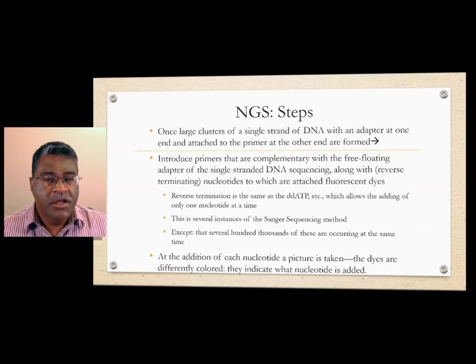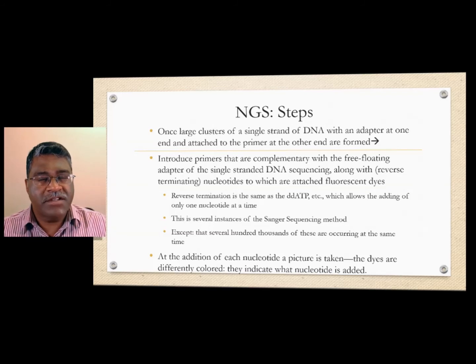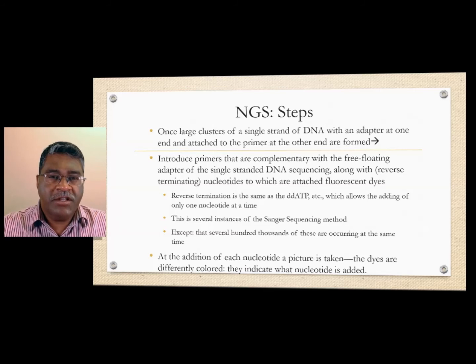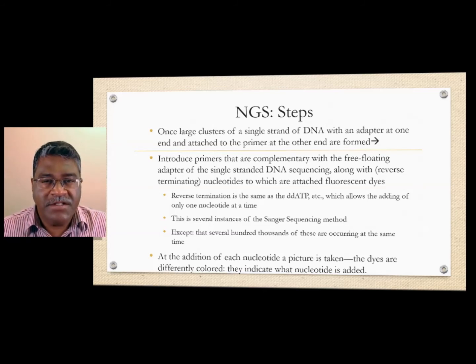This is possible, but data storage is a problem. So think of this experiment where at every step, hundreds of thousands of these in these channels or the microbeads, when each nucleotide is added, you take a picture. And then you take another picture, you take another picture. So all this data has to be stored. Think about essentially a movie, right? And this is a good analogy.